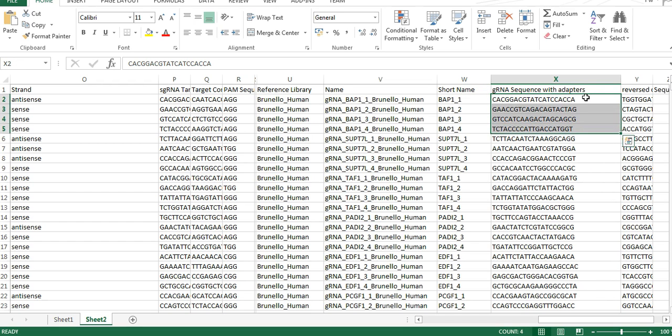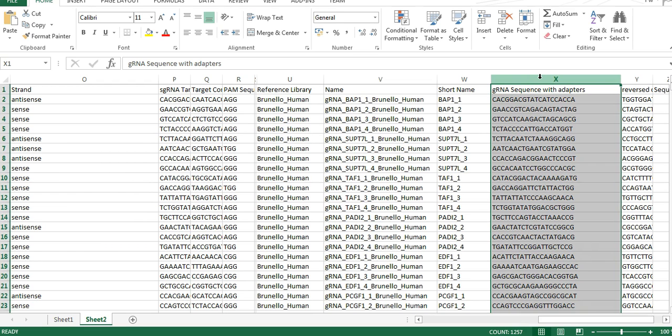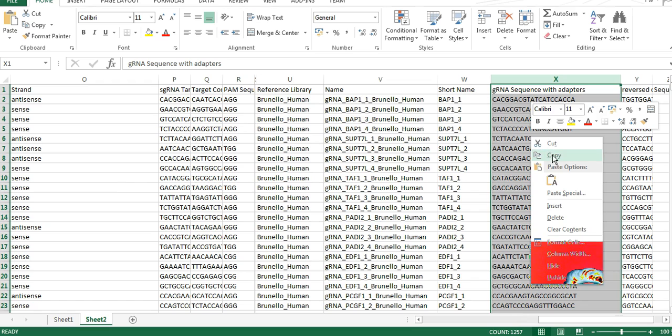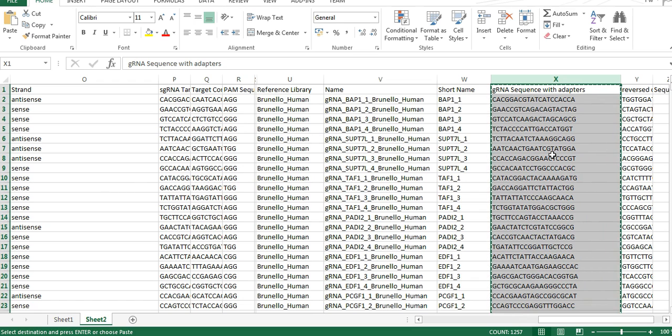This is very informative, but of course, there's also a short name here that's more easy to work with. And then there is the guide RNA sequence. And if there would have been adapters, if we would have added them, it would have been here. And what basically you do, if you're interested in this library, you would just take this. You would copy it. You would send it to a company that would synthesize these as an oligopool. And then you can work with that.